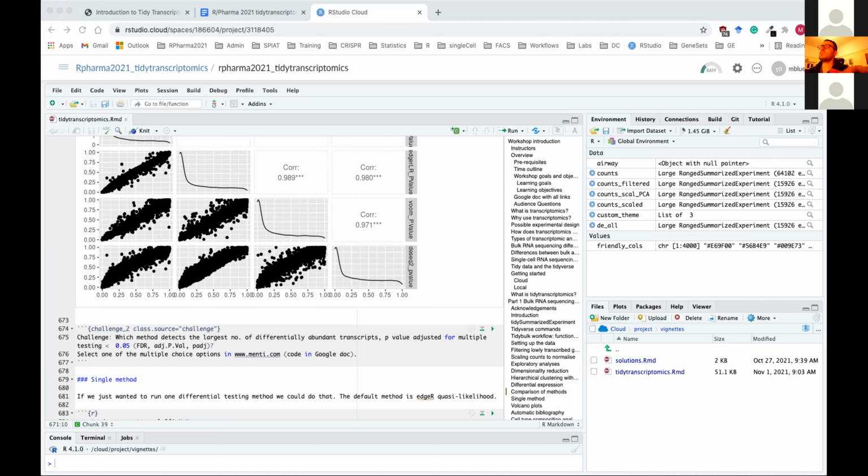Okay, and again, this is an opportunity while we pause. If you've got any questions you want to ask us, please feel free to put them in the chat. I think there was one question. Okay. If you see that. Yeah. So for DESeq2, somehow specify that I want to use truncated LFC.